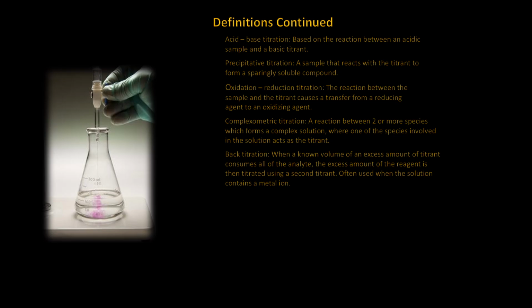The metallic ion in the second titrant must be weaker than the ion that reacted with the EDTA, so that the sample ion is not displaced from the EDTA complex during the second titration. These titrations are needed when the metal ion blocks the indicator, or when the metal ion forms the EDTA complex too slowly, or when the metal ion precipitates in the absence of the EDTA.